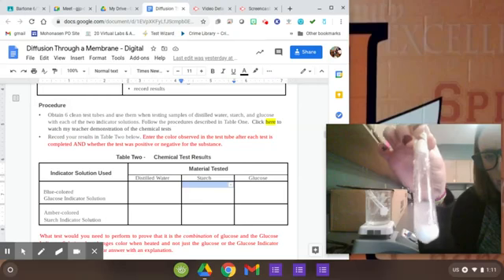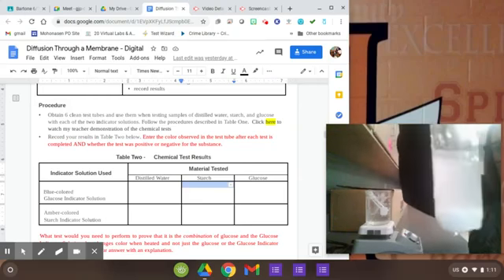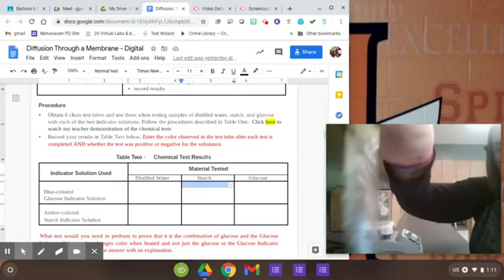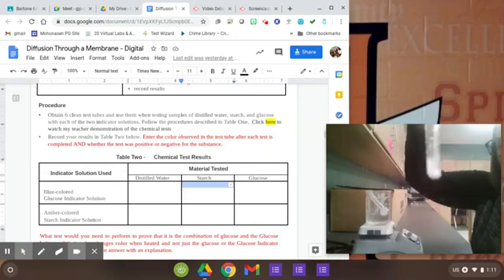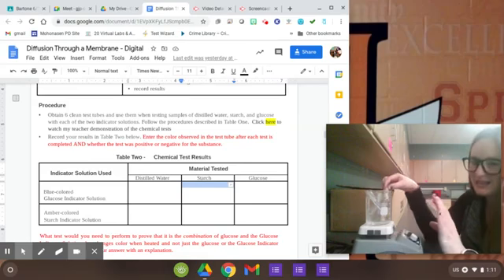I'm trying to keep it from dripping on my Chromebook. But it's still just that clear, cloudy color. Here I am shaking it around, getting it on my Chromebook anyway. It has not really had a color change. So that is a negative reaction. And it does have a slight light blue tint to it. It's not a lot, but a little bit.